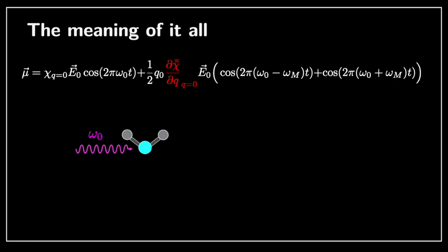So this is the frequency at which the electric field oscillates from the laser light. Okay, good. So you see that we have on the equation on the top 3 terms. We have the first term here that's going to oscillate at omega naught. And this is actually a scattering. This is called Rayleigh scattering. And the Rayleigh scattering happens at the same frequency, while you see the response to mu is oscillating at frequency omega naught. So Rayleigh scattering is what we use to show why the sky is blue.